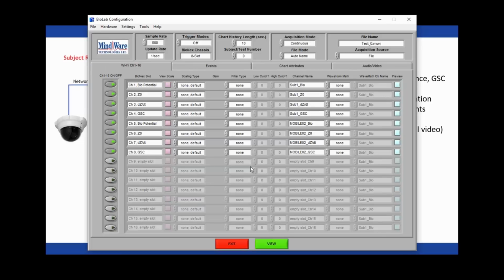And this is going to export the events in a standard MindWare event file format, which is the event file that we used to use with the .mw file format. And this format is also described in a knowledge base article on the support site. So you can go on there, just type in event file, pull that up, and that will inform you on how to read the events out of the system. But the first step is to go to File, Export Events to get that information out.